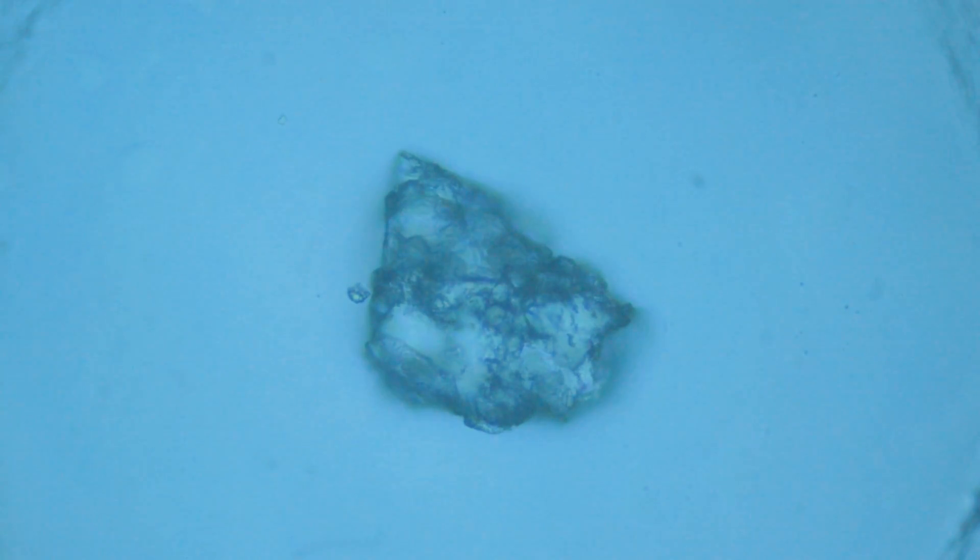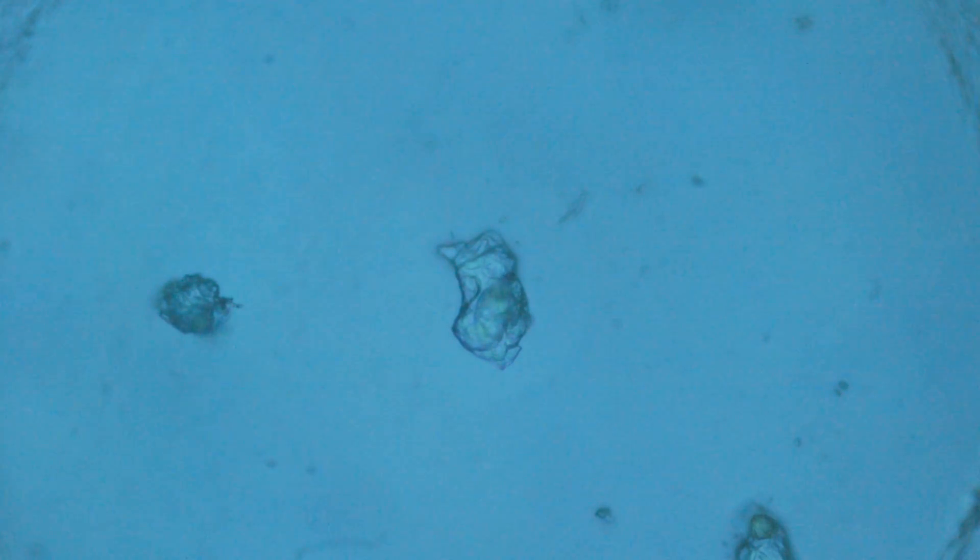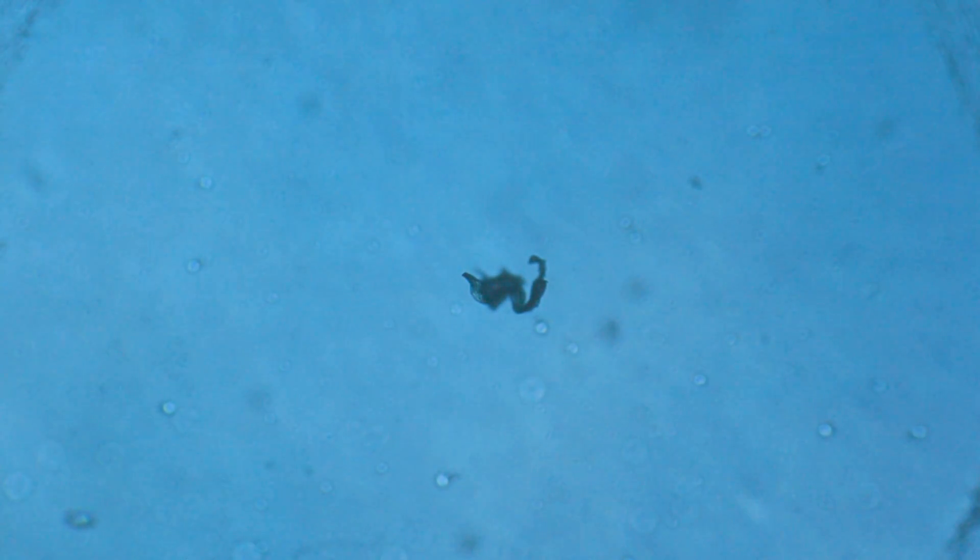These flake-like things were probably pieces of dead insects. This was probably a leg of a fly. These are the kinds of particles that reflect the sunlight and paint our atmosphere blue.